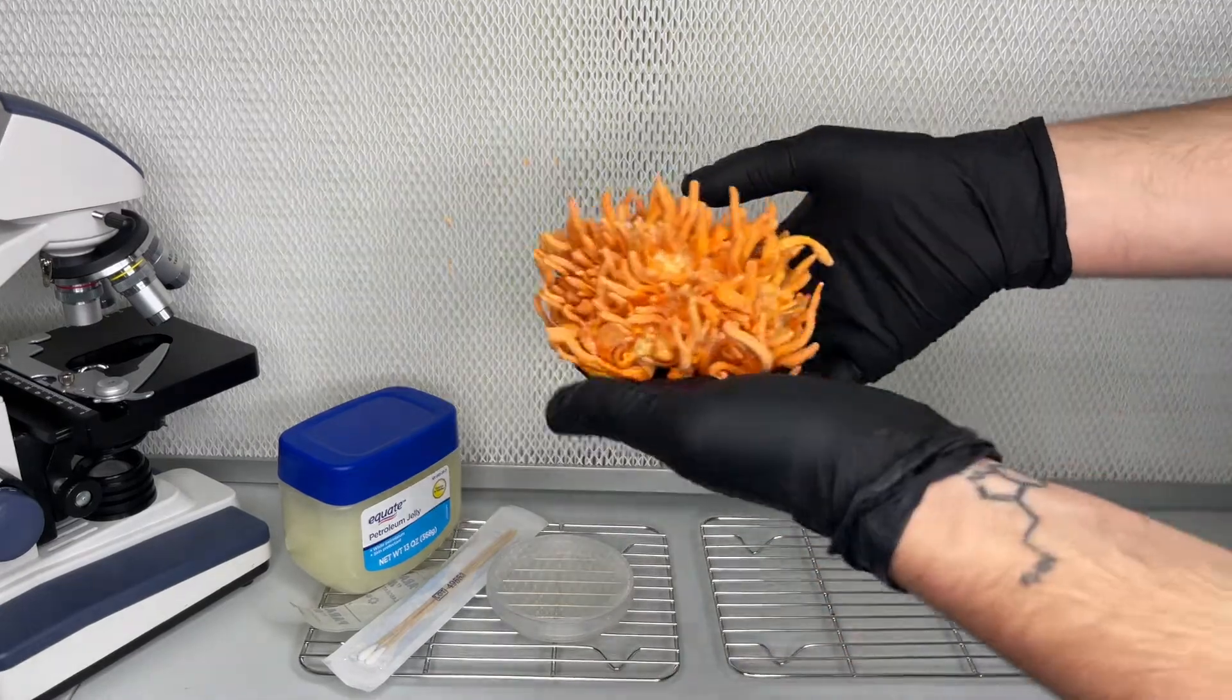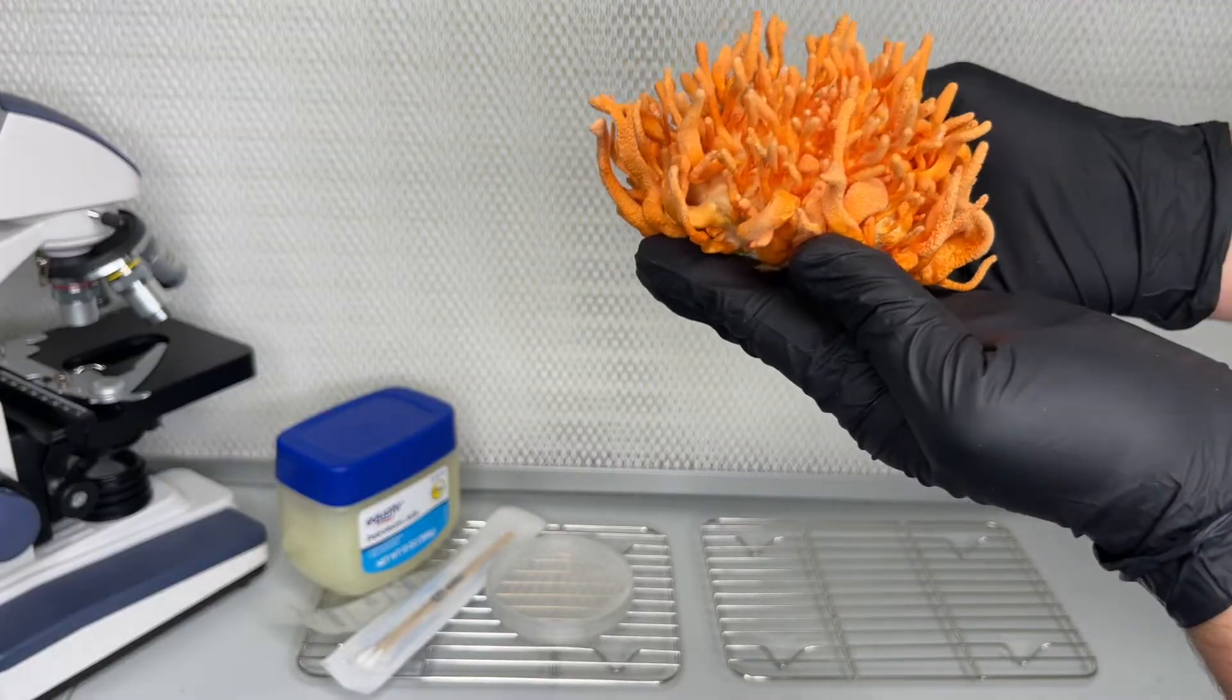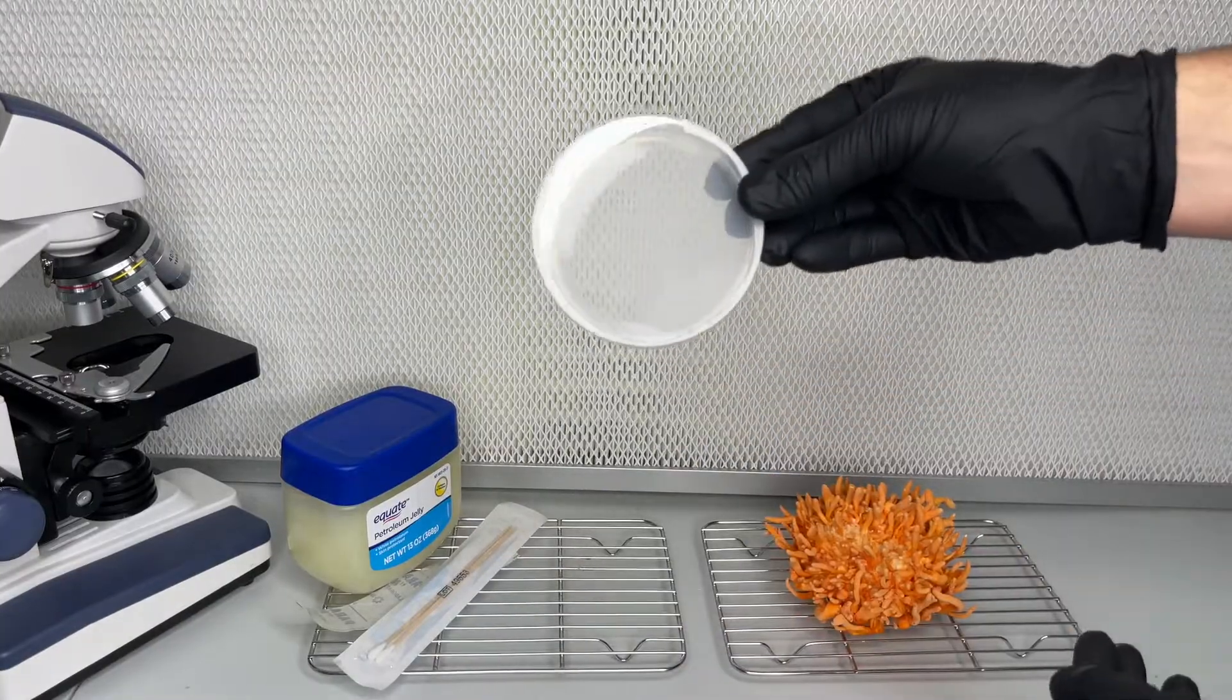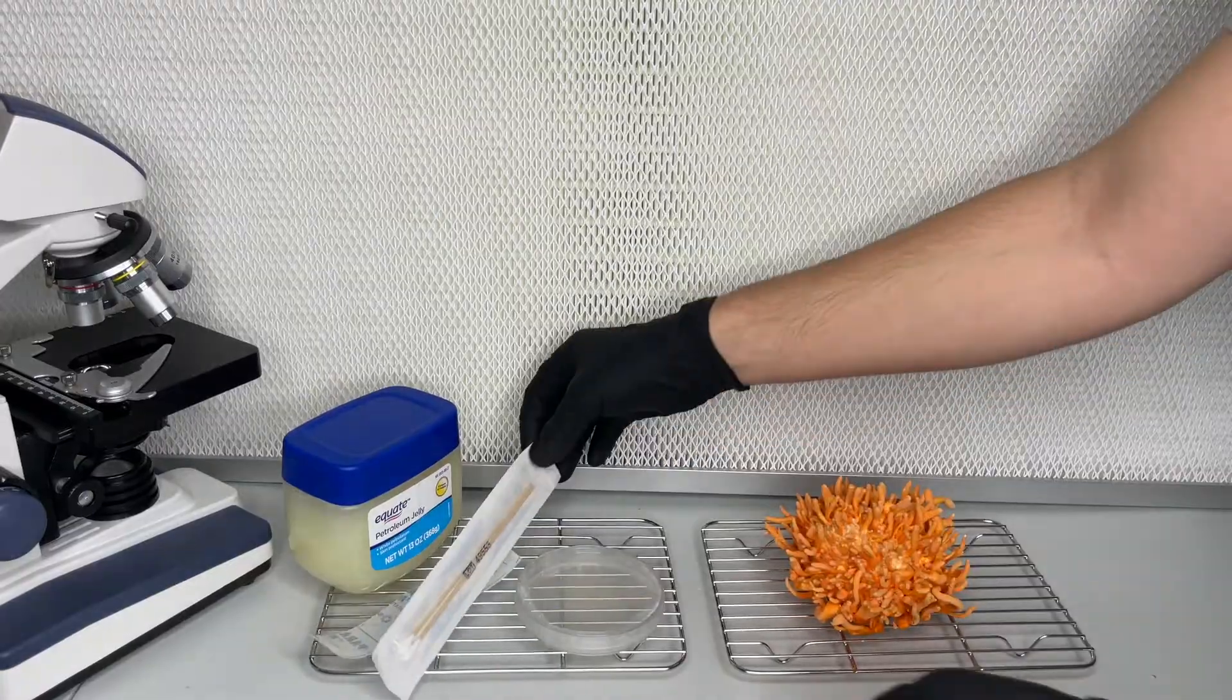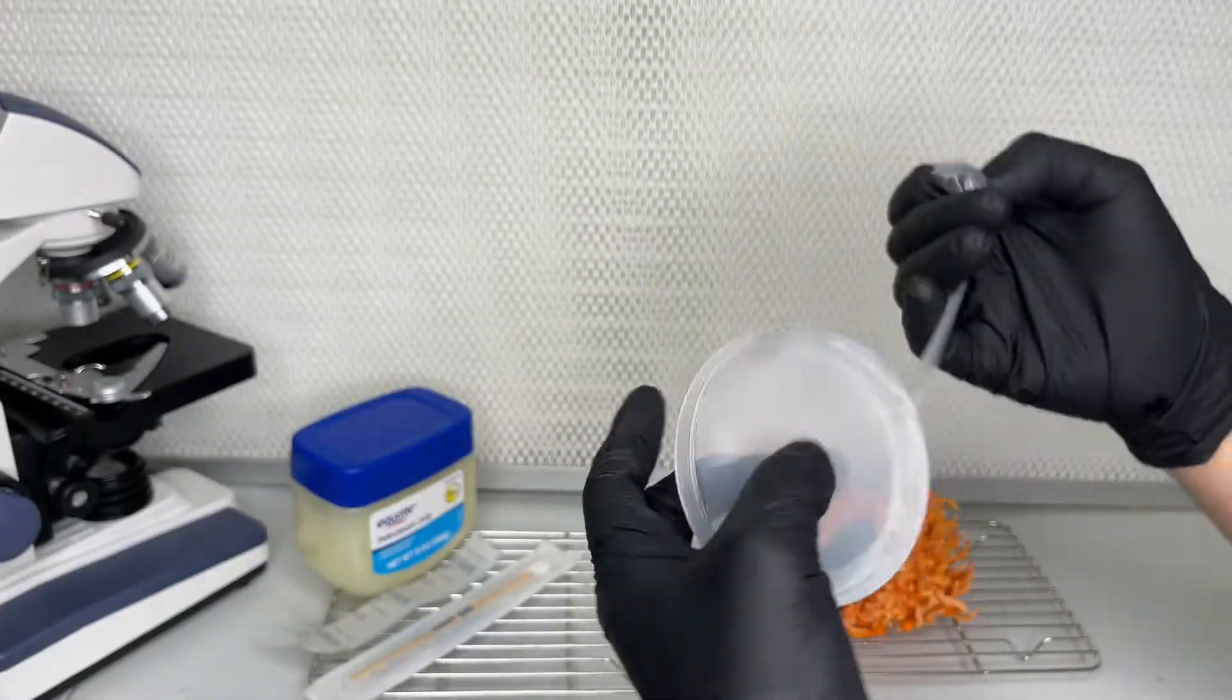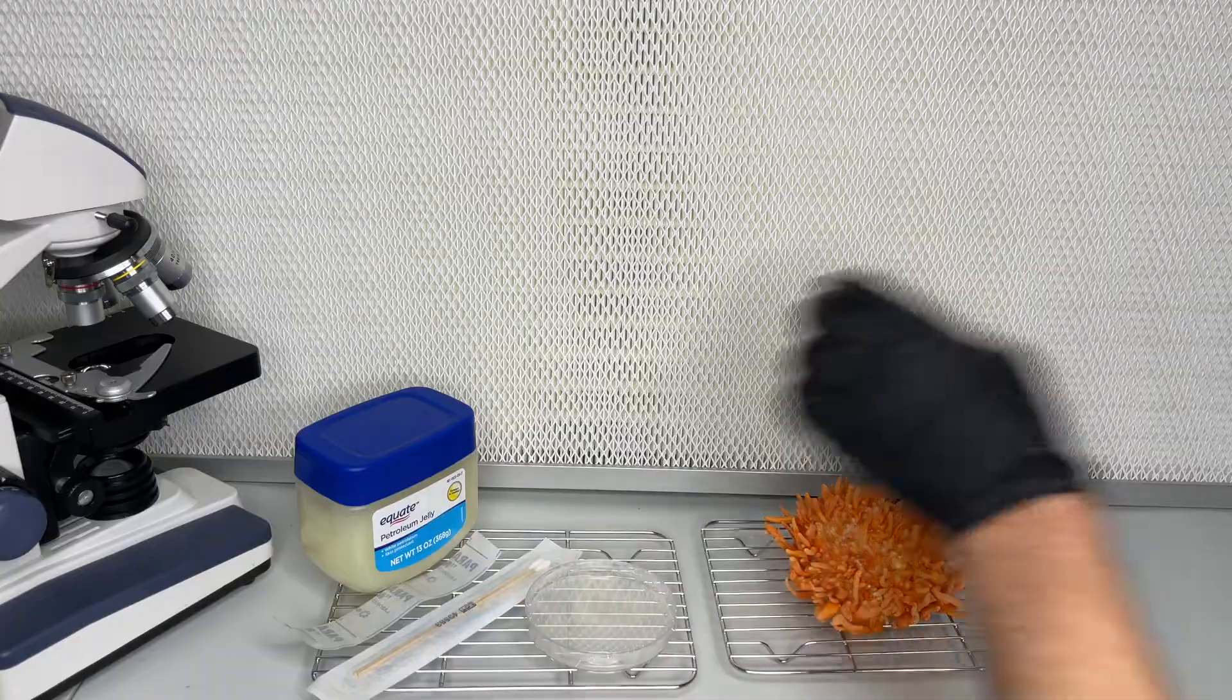Cordyceps militaris is more prone to genetic degradation or senescence compared to other mushrooms like oysters. When the mycelium is exposed to high temperatures, over-expansion, or old age, it will start producing deformities and mutations. In this video, I'm going to be collecting multi-ascospore isolates to start the life cycle over.